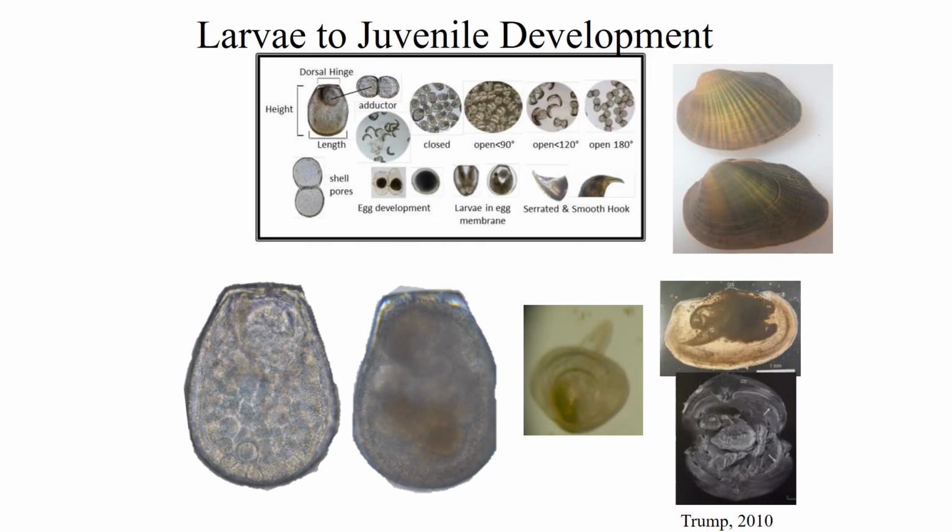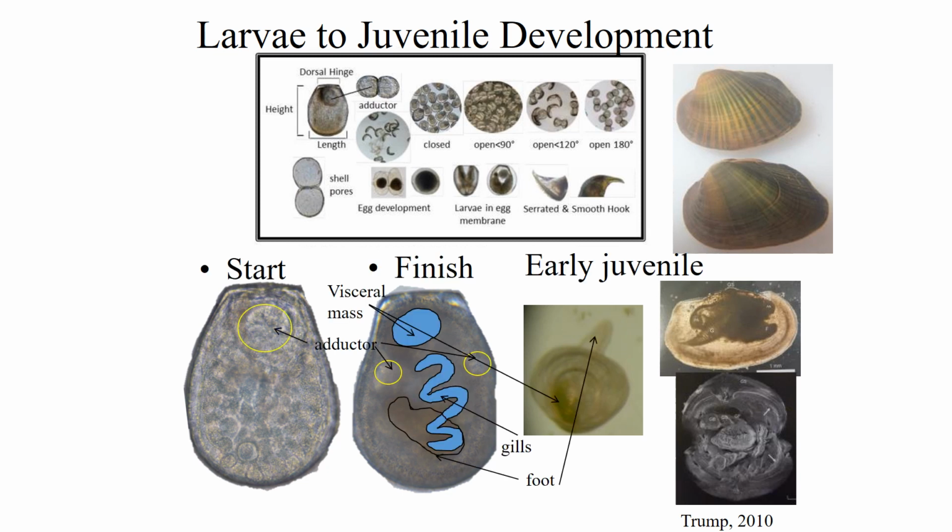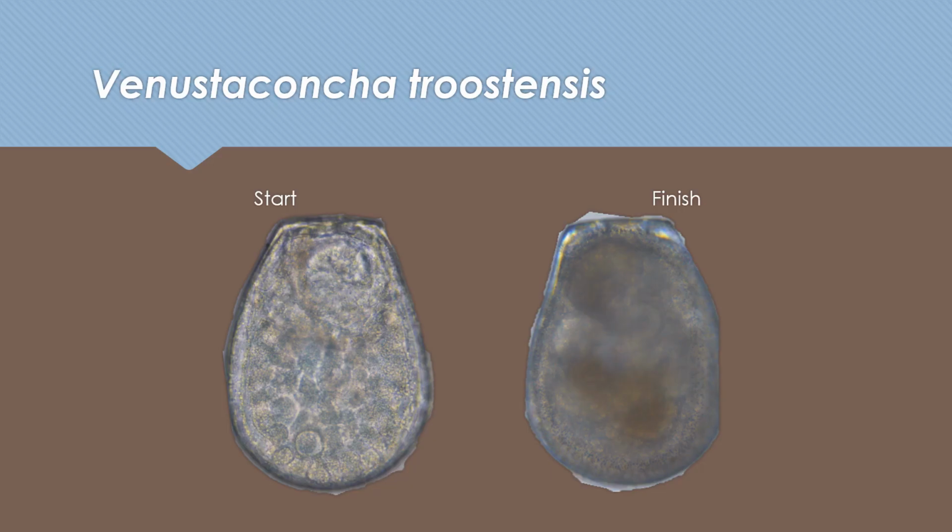So what happens is you put the larvae into the dish, and over time they transform from the original larval form to the juvenile form. You see the foot, the adductor muscles, the gills, and all that transformed in about a 2-week period under normal conditions. Here's the start on the left, finish on the right. You can see they're quite different anatomically, and we're always looking for these adductor muscles and the gills right here. And here's the foot.